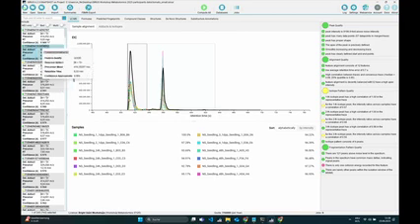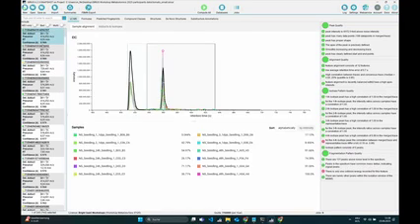So here you see we have a confidence score of 0.984. So it's a quite high confidence score because it goes from 0 to 1. And now we can actually look at some stuff. So now the interesting part really happens. Let's just select this first hit. If you really want to follow along the exact example, this example should end on 2707.